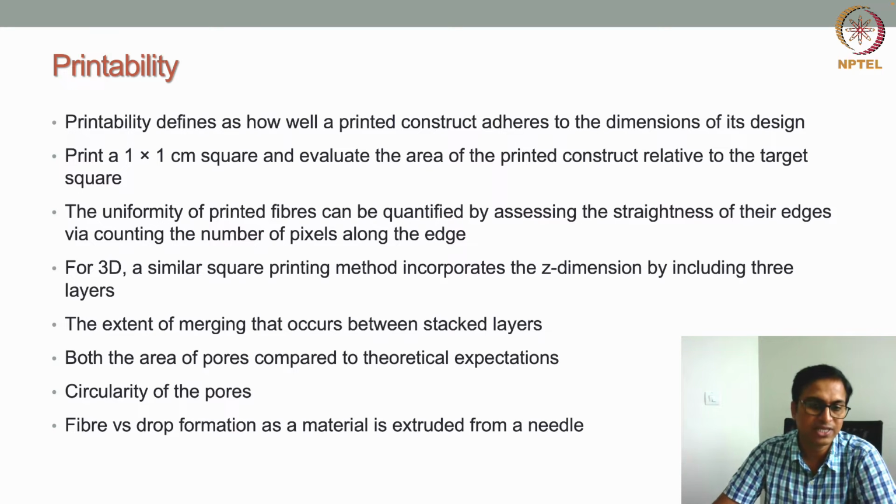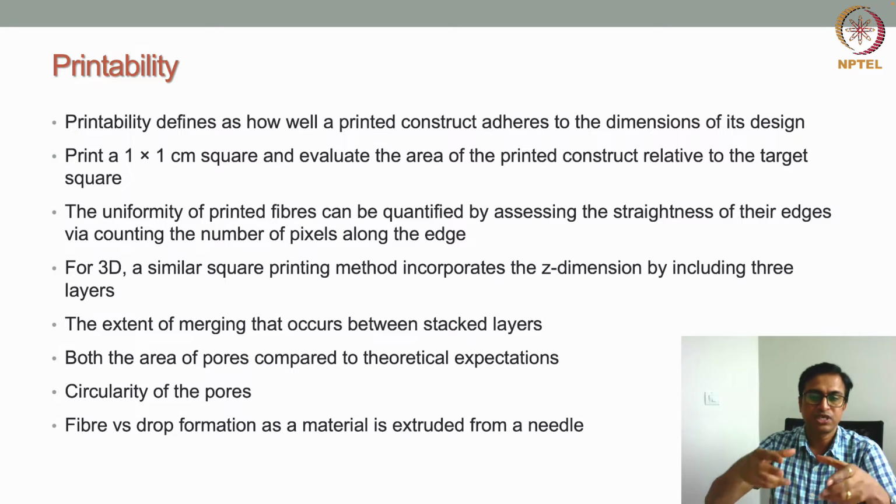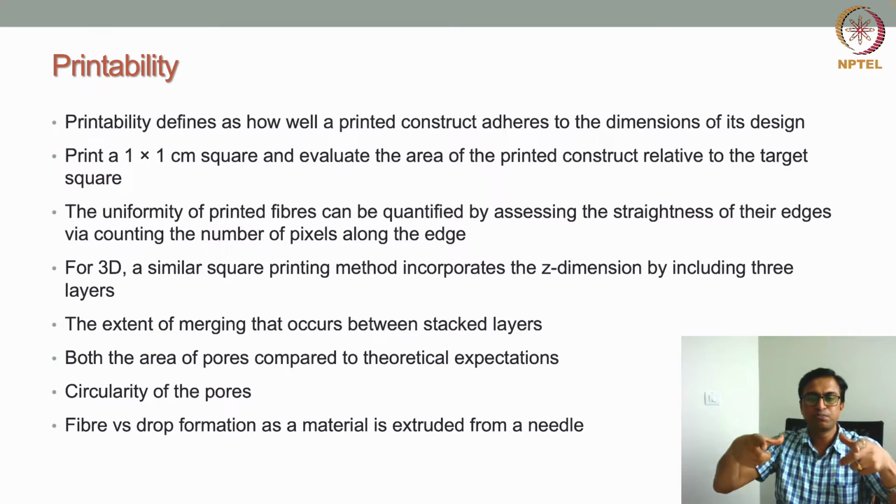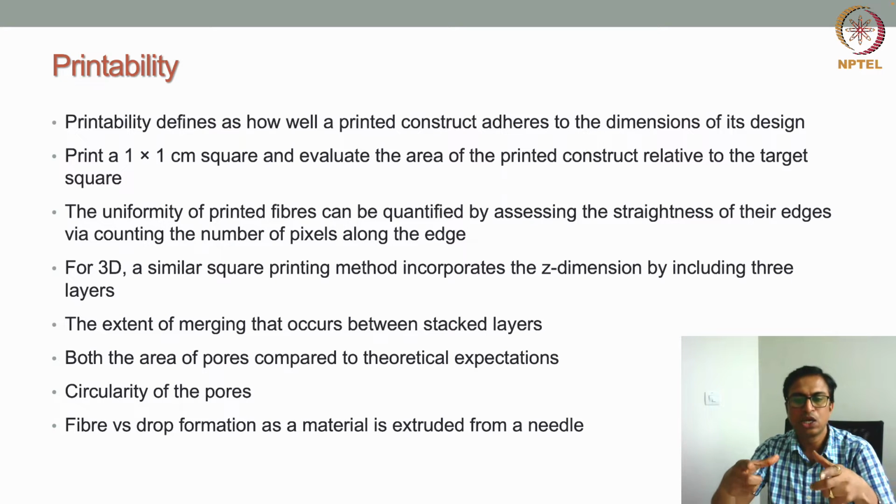That can easily be seen for certain bioinks. Whether the area of the pores compares to the theoretical extent. Suppose I created a lattice structure, a square, then whether the pores are a perfect rectangle, or circular, or there is a deformation. By this we can understand.